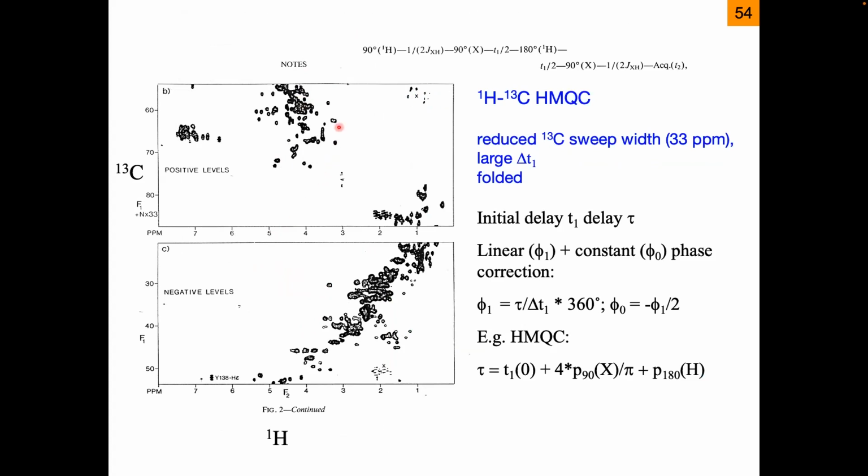And these are the folded peaks, and you could very clearly say this is folded, this is not folded, and then they are not overlapping, and this will not cause a real problem. So this trick you can do, but whether it is getting negative in the folding or not depends on your first order phase correction through the spectrum.